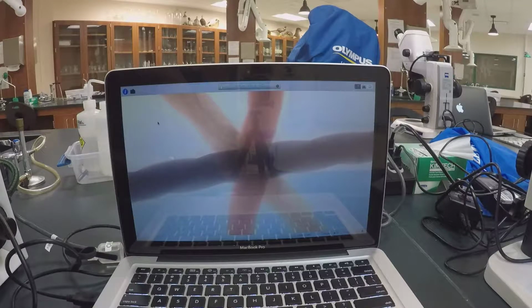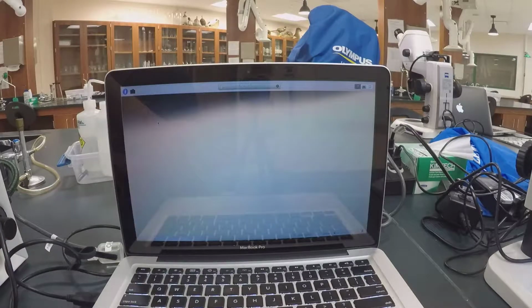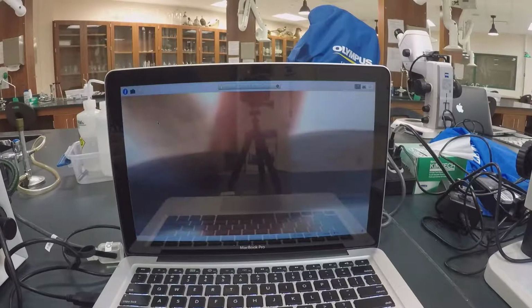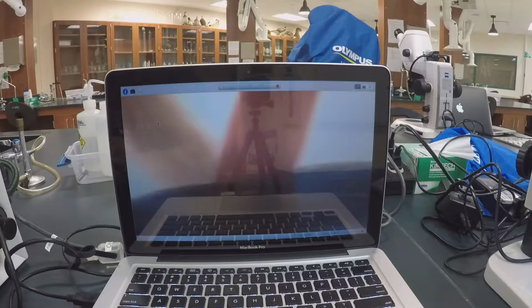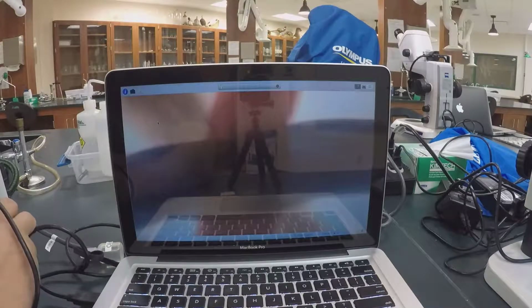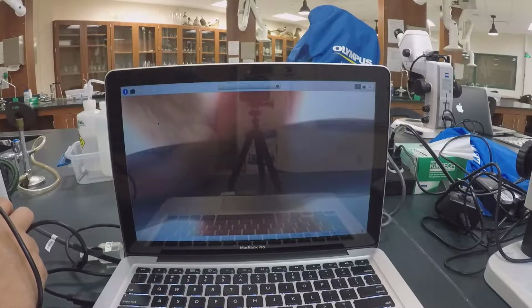Now, we're interested in what happens to the depth of the field as we increase the magnification. So now I'm going to go to 100 times your eyesight. Right, and I'm going to try to focus on the top string.